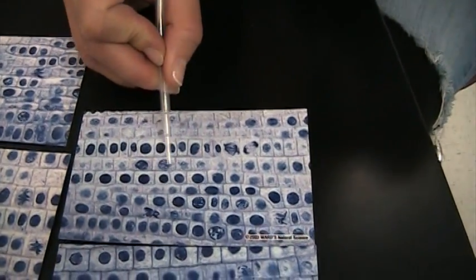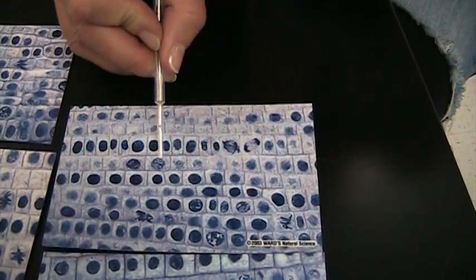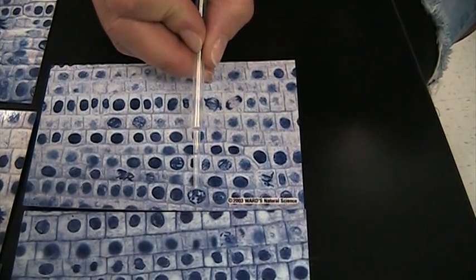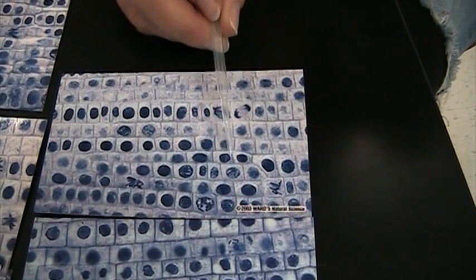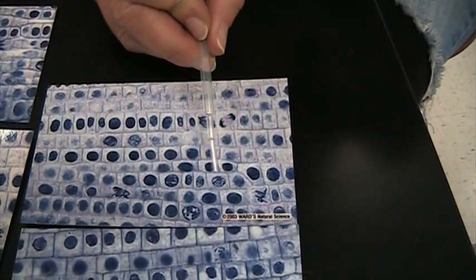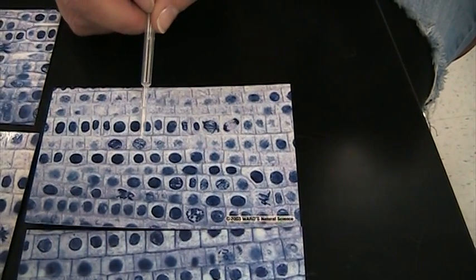Prophase is going to be where you see these black and white sections. So this cell is prophase, this cell is prophase. Any time you see kind of mottled or black and white portions, you have prophase.